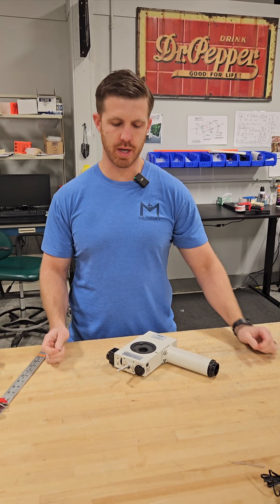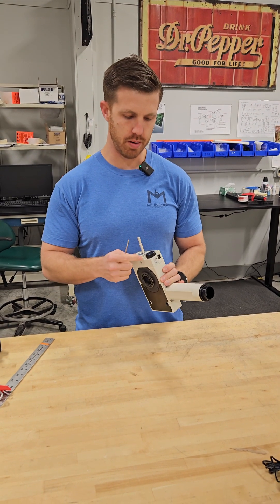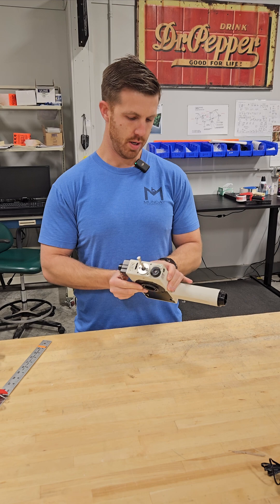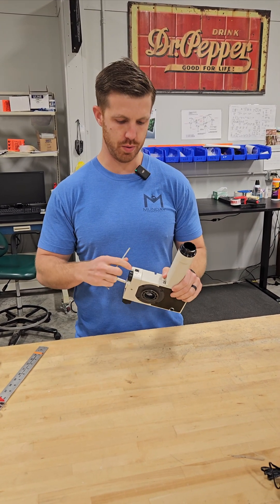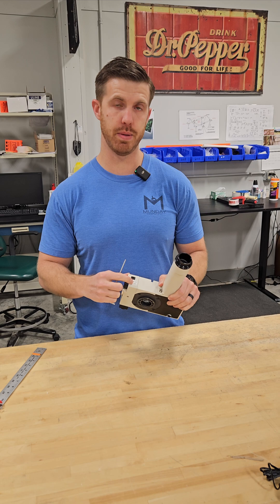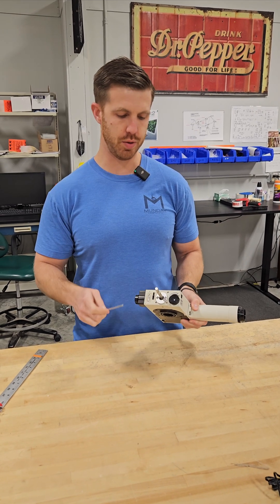Hey, this is Chad with Monday Scientific. Today we're going to show you how to take a pointer out of a Nikon. This is a THS and the pointer itself is a THP. What we're going to do is take this unit out.